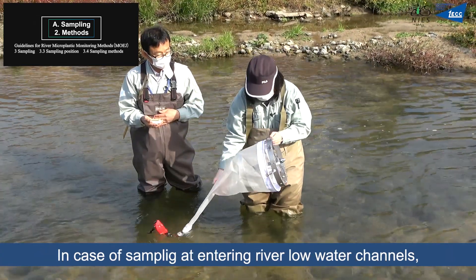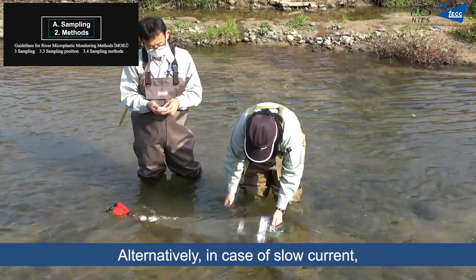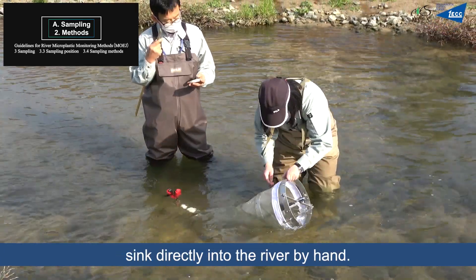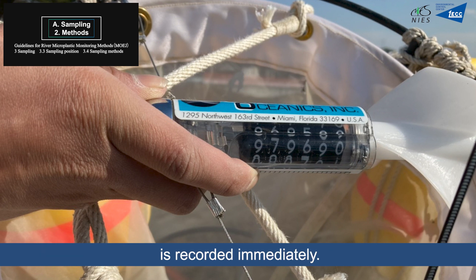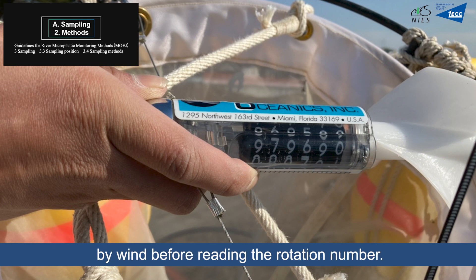In the case of sampling at river intake raw water channels, fix the rope to a bar. Alternatively, in the case of slow current, sink the net directly into the river by hand. After the required filtering water volume has elapsed, the net is pulled up and the rotation number of the flowmeter is recorded immediately. Care must be taken not to rotate the rotor of the flowmeter by wind before reading the rotation number.